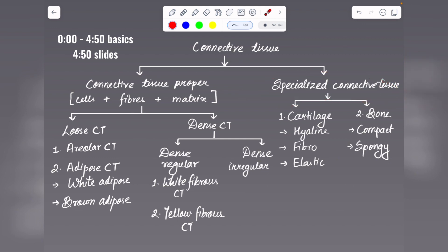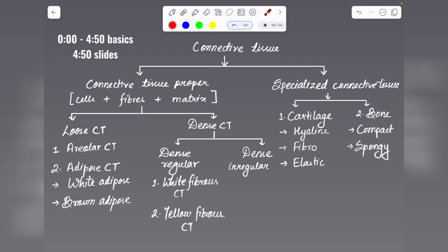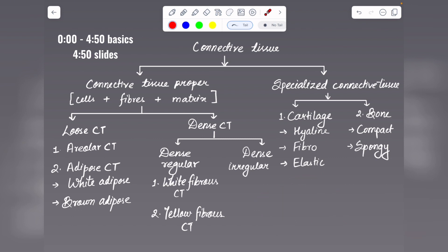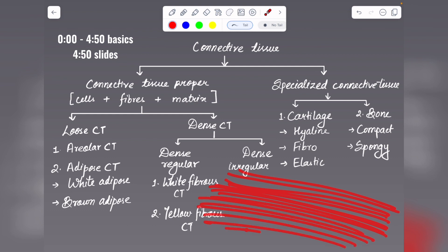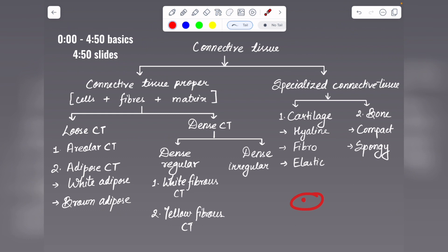Under specialized connective tissue, there are two things to examine: cartilage and bone. Cartilage contains chondrocytes inside fluid-filled spaces called lacunae. Hyaline cartilage has chondrocytes present in lacunae, with multiple chondrocytes forming a nest, lying on a clear matrix. Fibrocartilage has high deposition of white collagen fibers with chondrocytes arranged in streak-like rows. Elastic cartilage is similar to hyaline but chondrocytes are mostly solitary inside lacunae and the matrix is opaque.